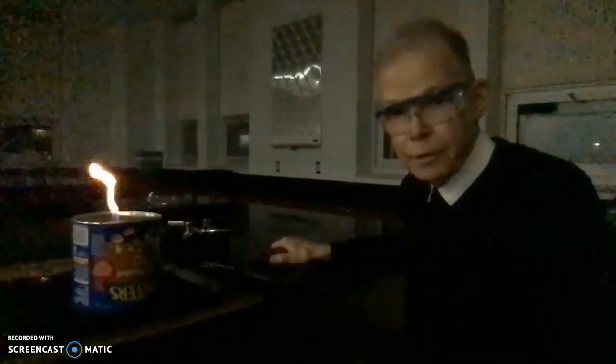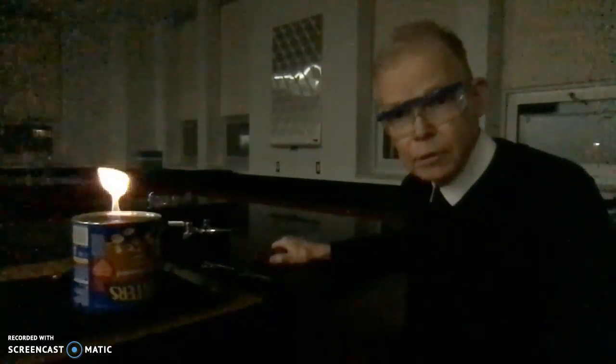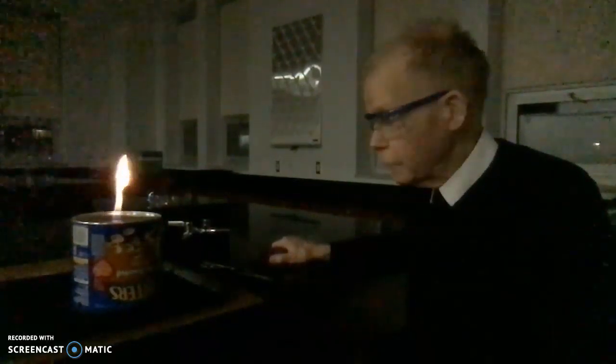So at some point, that mixture is going to become perfect for a reaction that is a combustion and a little bit more. So let me pause the video at this point, and when I bring it back, you'll probably see less flame, and we'll be closer to the finishing of the combustion.